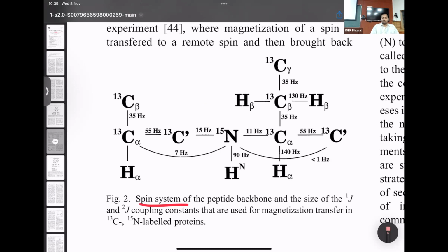So one of the JNC coupling values you're trying to see, you immediately realize these are actually smaller in magnitude. About 10 to 15 Hertz is all that you have for an NC coupling. So slowly you start to appreciate that yes, you started with something like 100 Hertz, but you're going quickly to lower tens of Hertz, right?